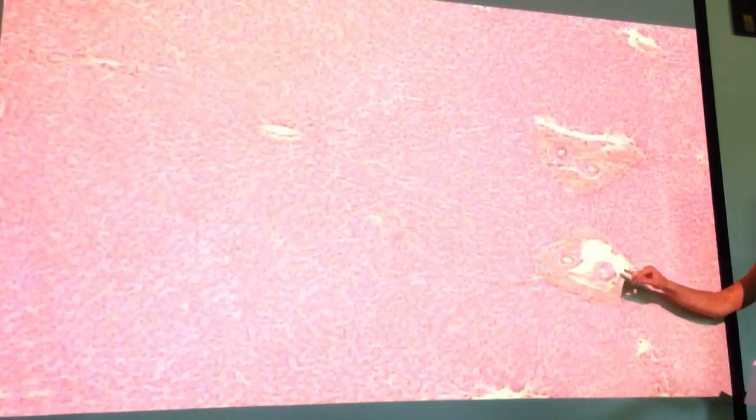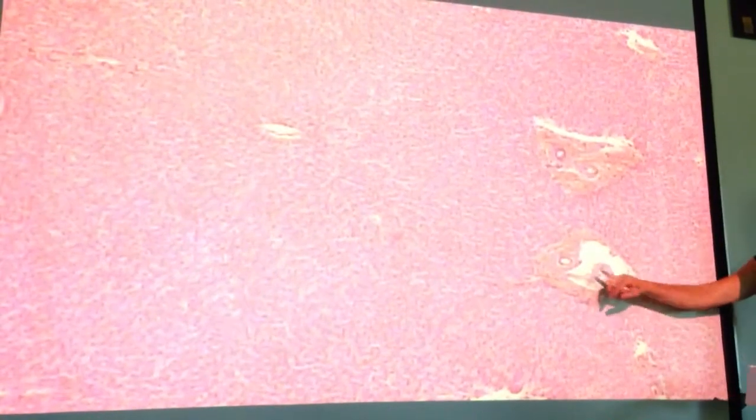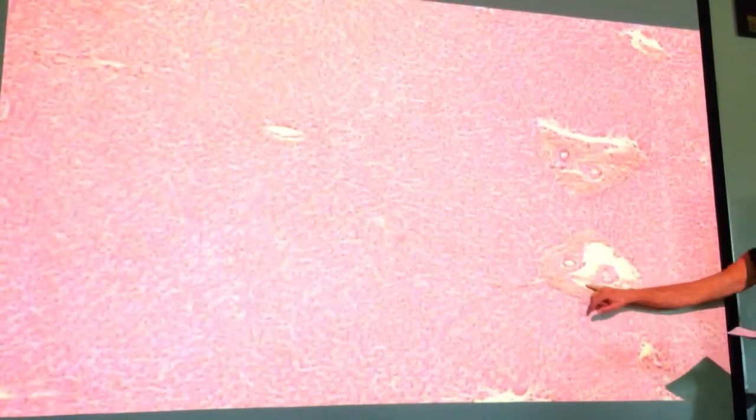Over here, you can see this round structure that's about the same size as the bile duct. That's going to be the hepatic artery. Now, you kind of just have to look for the rough tissue, because these veins are typically hard to find. But this would be a portal vein over here in the corner.